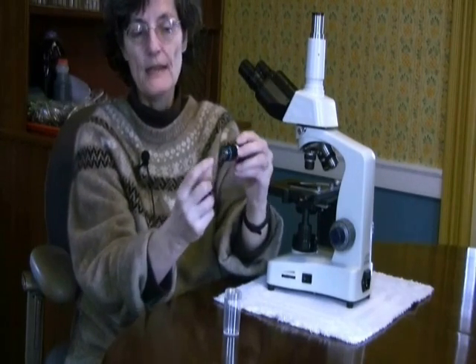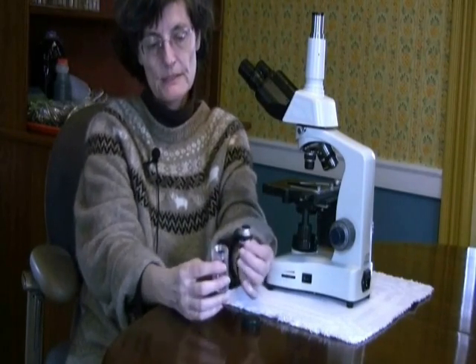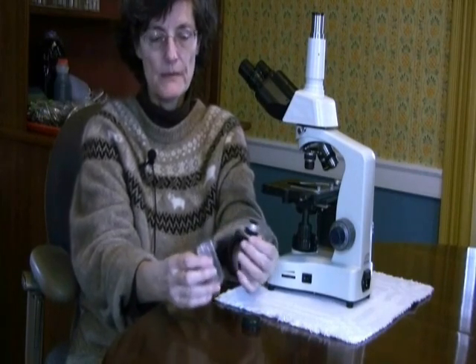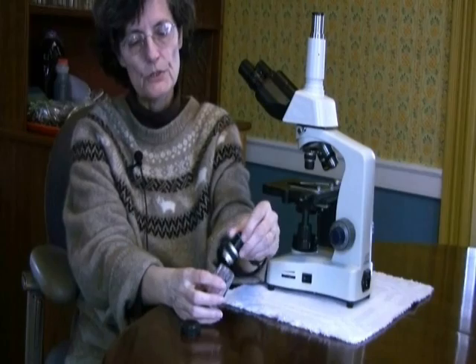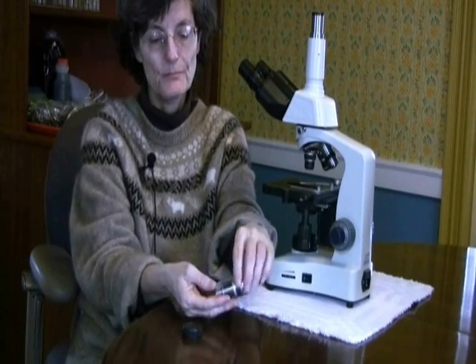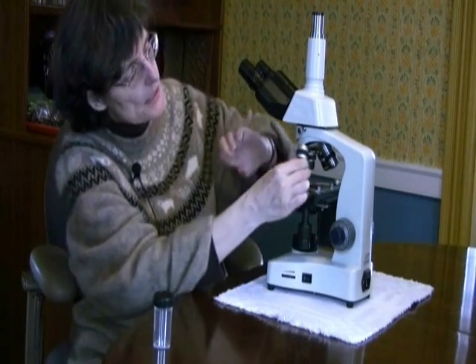You want to make sure that that never gets scratched, that never gets smacked into anything. So having that in the lid is a very easy way to make certain that that objective never smacks into the bottom of this. Now, what if you lost that lid or you don't have a screw-in top lid like that? Then you would turn your objective over and store it like that. You know, cover it up and protect it in that fashion. But even better is to have the lid that you screw your objective into so it's safe from being smacked up against the bottom.